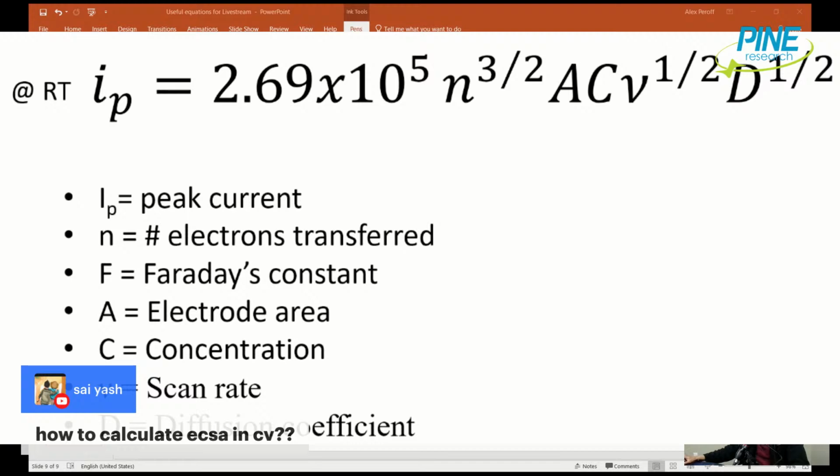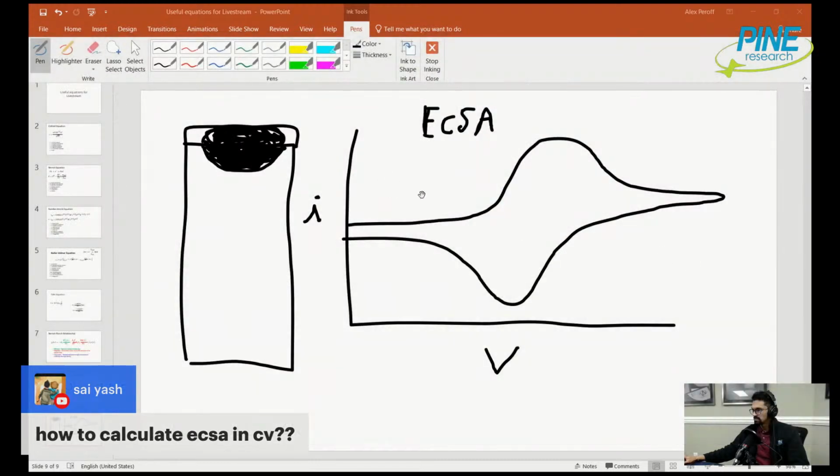You would get the peak, you'd find the peak here. You wouldn't use this one, right? So if my voltammogram was like so, if it started here and I was scanning this direction, this is the peak current, not this guy. You wouldn't want to use this. This current value would not necessarily be accurate for your experiment.